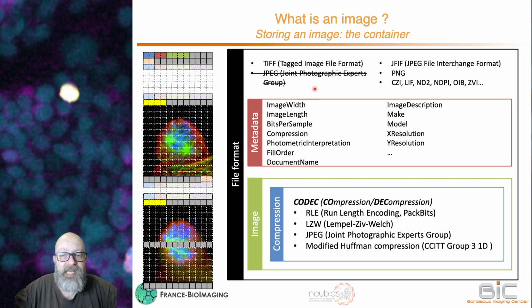JPEG stands for Joint Photographic Experts Group. In fact, this file format was released when we had the first digital cameras.